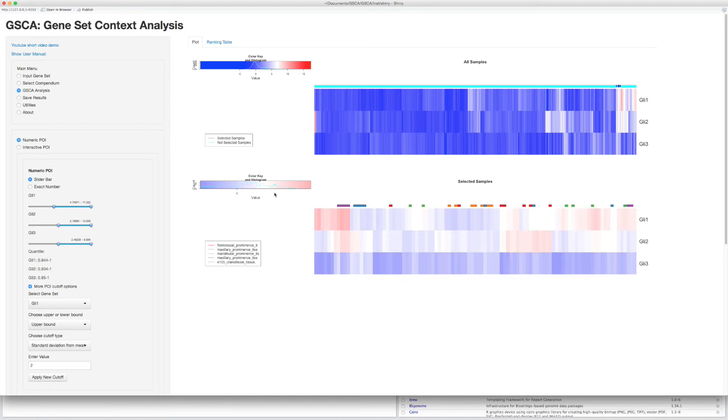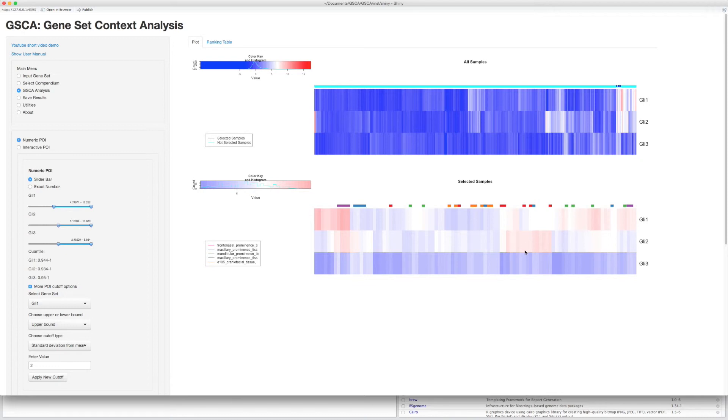The first heatmap shows the gene expression levels of all samples in the compendium. The samples indicated by dark blue are selected samples. The second heatmap shows the selected samples and the legend shows the top-ranked enriched biological context. You can change the POI by changing the bars here.